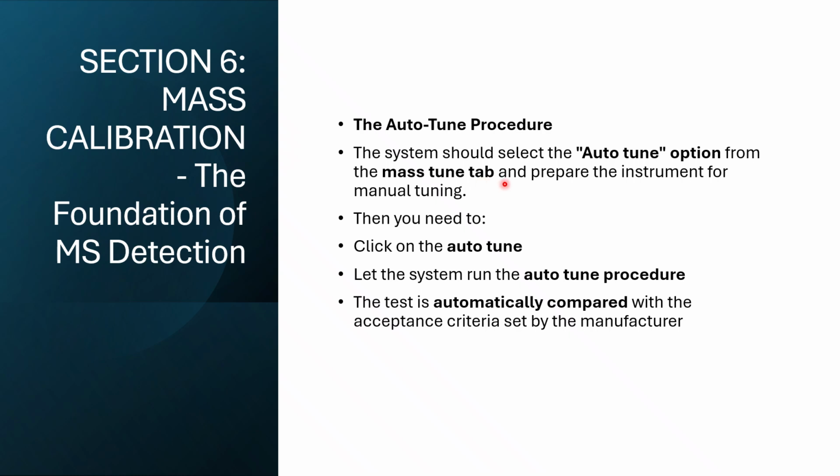So in this, what is injected is your tuning solution, and there are different mass to charge ratios present in that tuning solution, which is checked. The tuning solution is called perfluorotributylamine, that is PFTBA, and the masses that are calibrated are 502, 69 and 219.